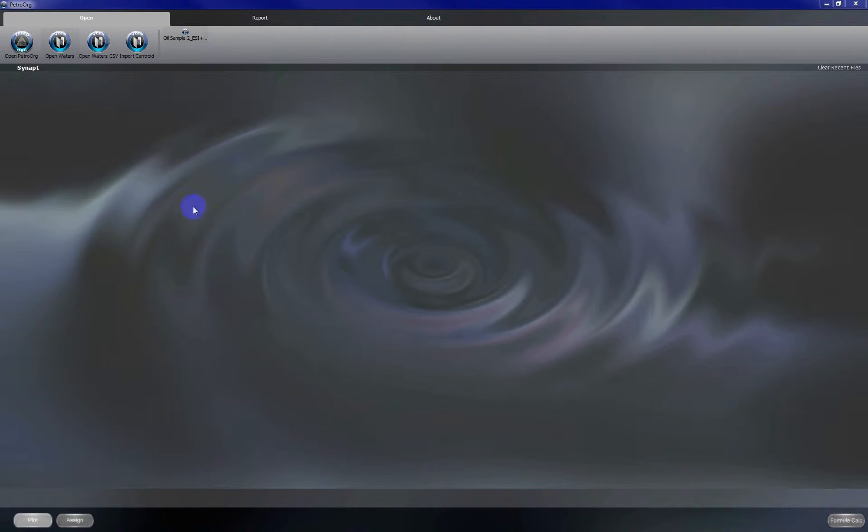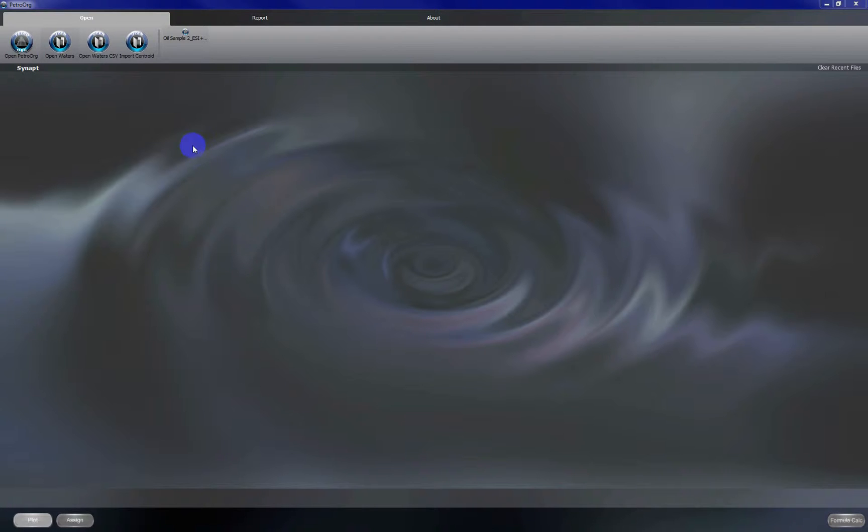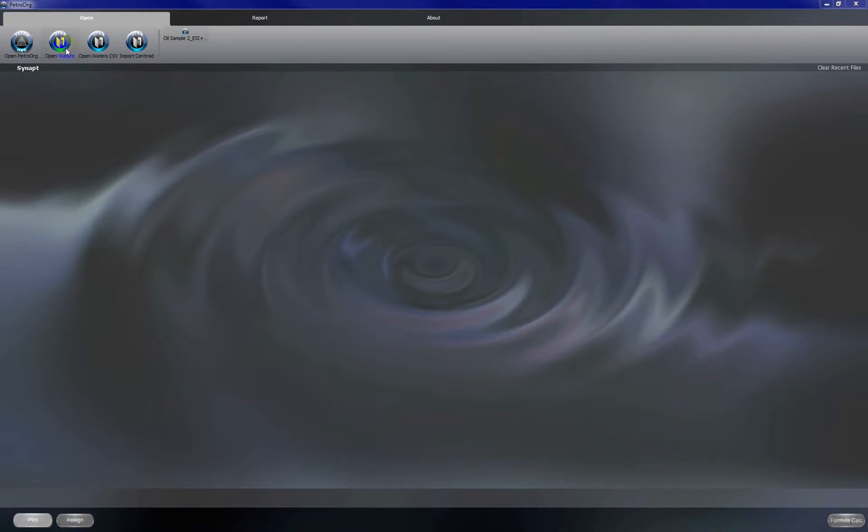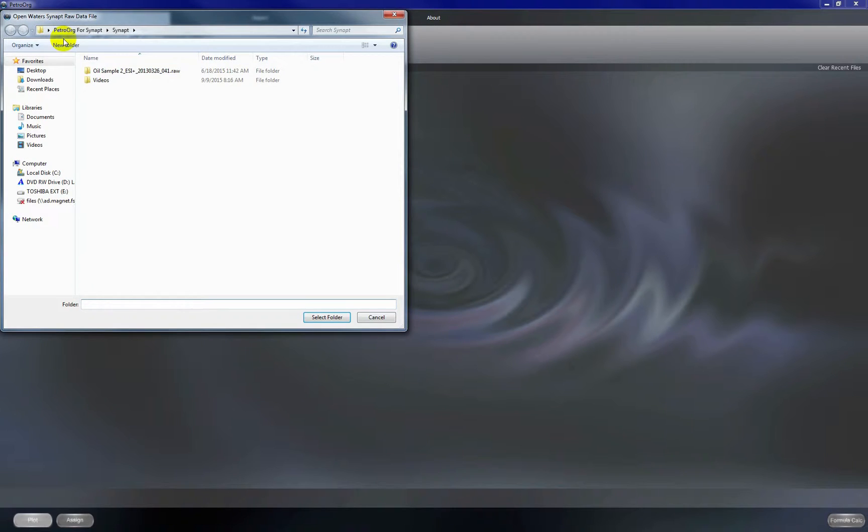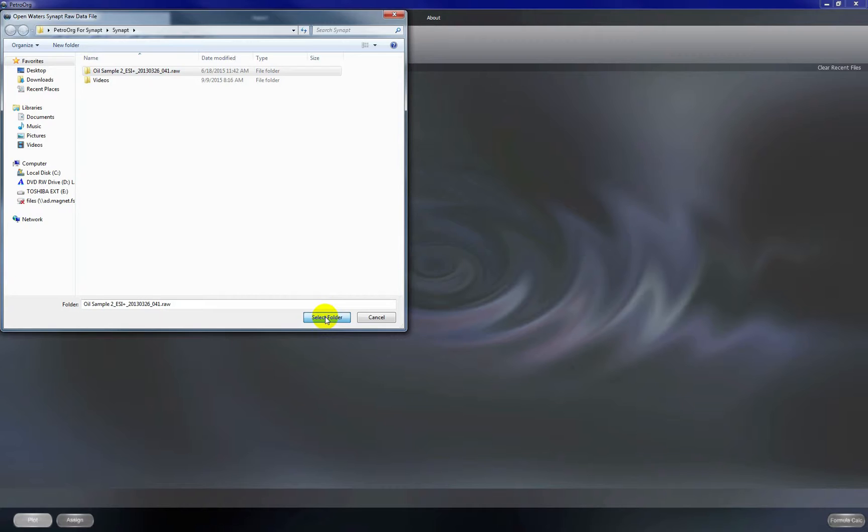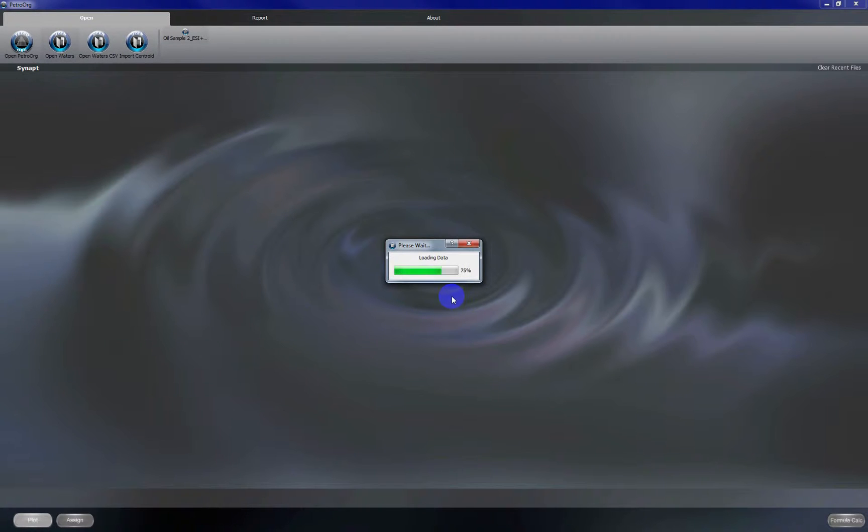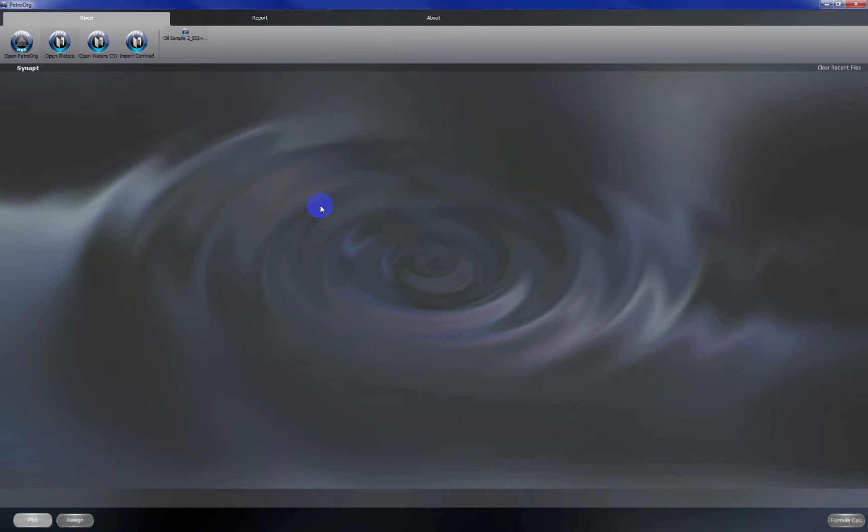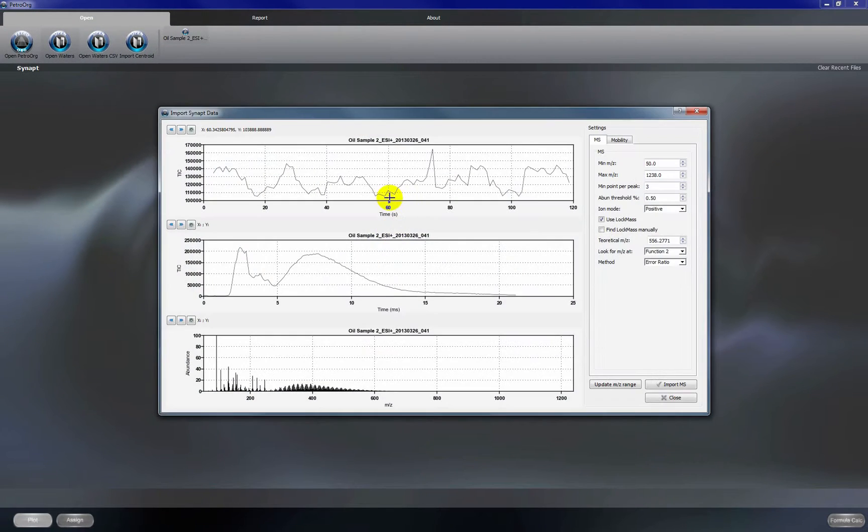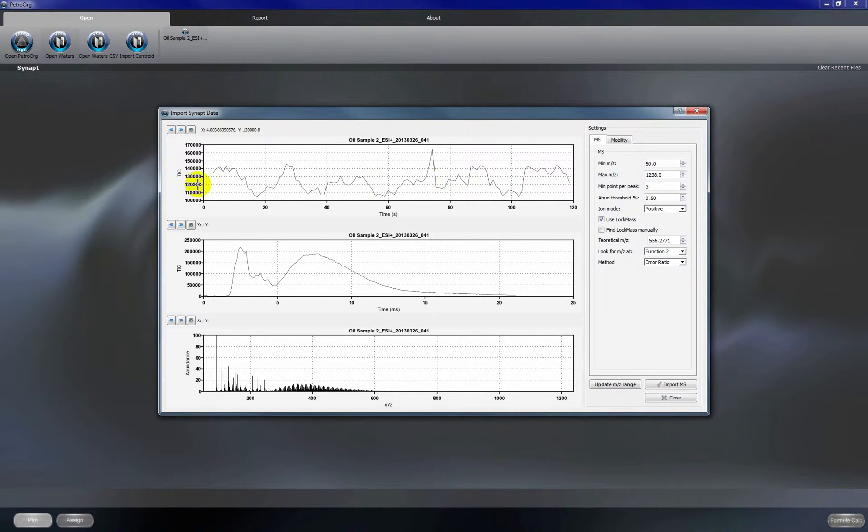This video is going to show us how to open Synapt data with the PetroOrg software and how to import the data for data processing with PetroOrg. So the first thing we're going to do is click the open Waters tab and select the file of interest. Click select folder and this is going to open up a dialog box for us.